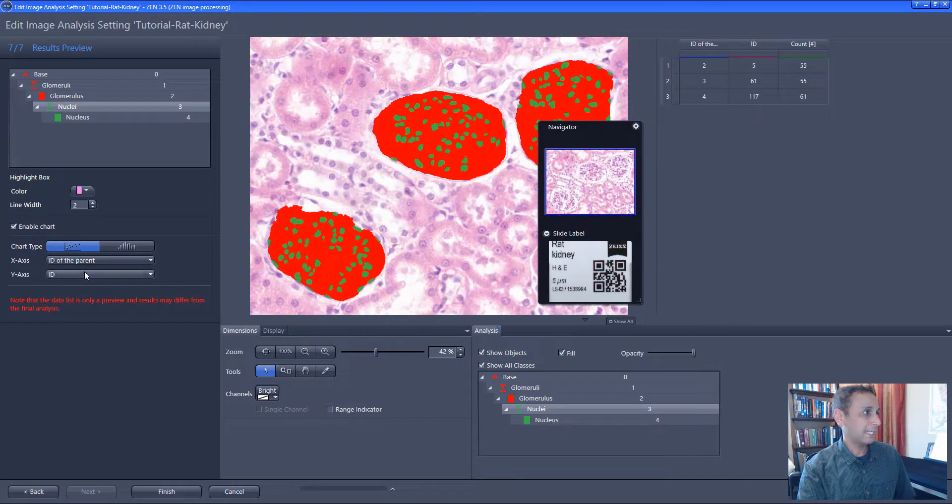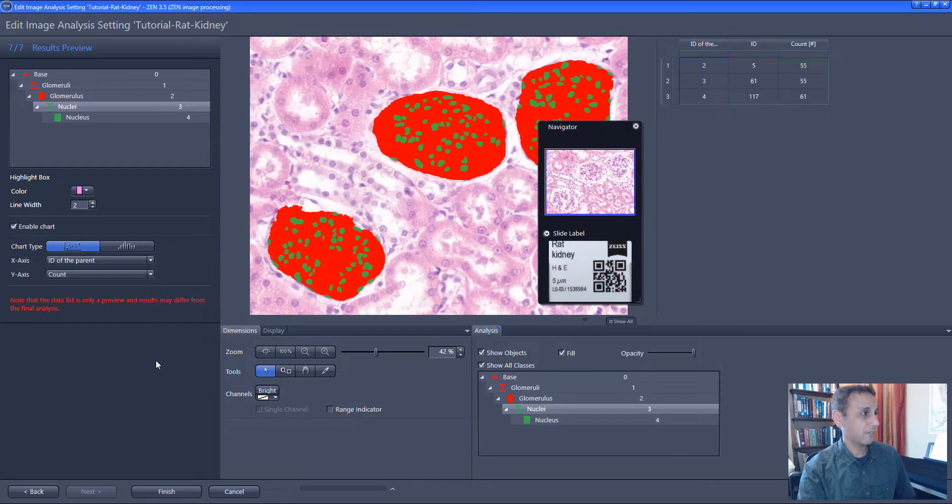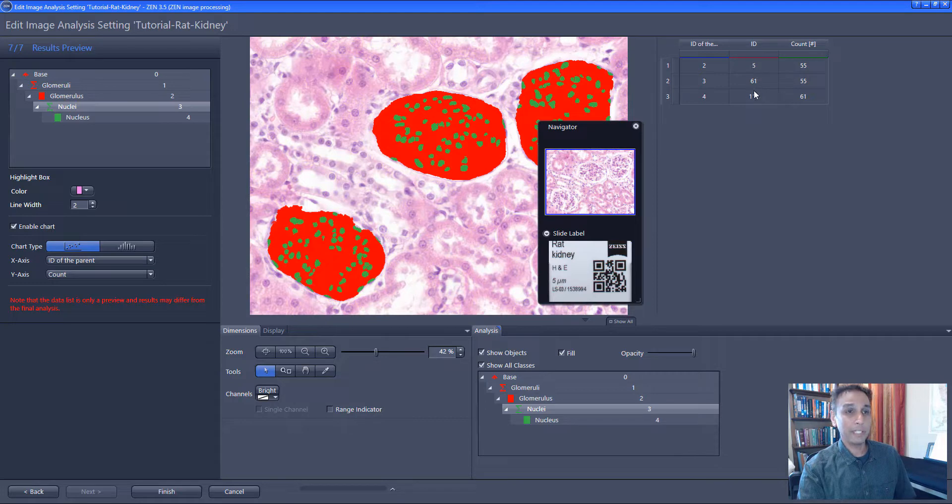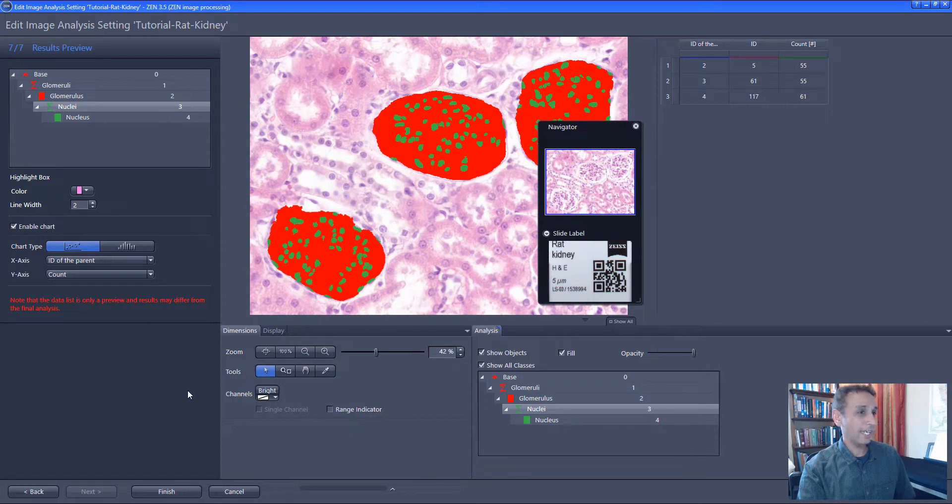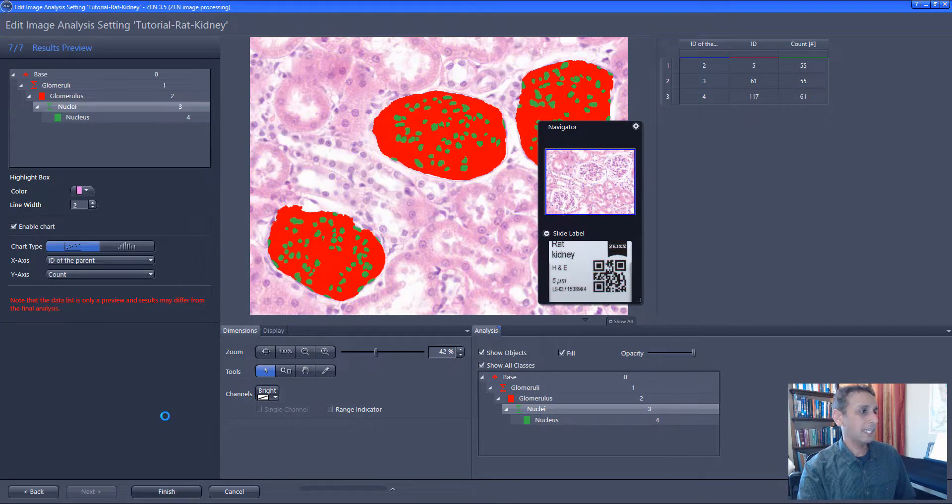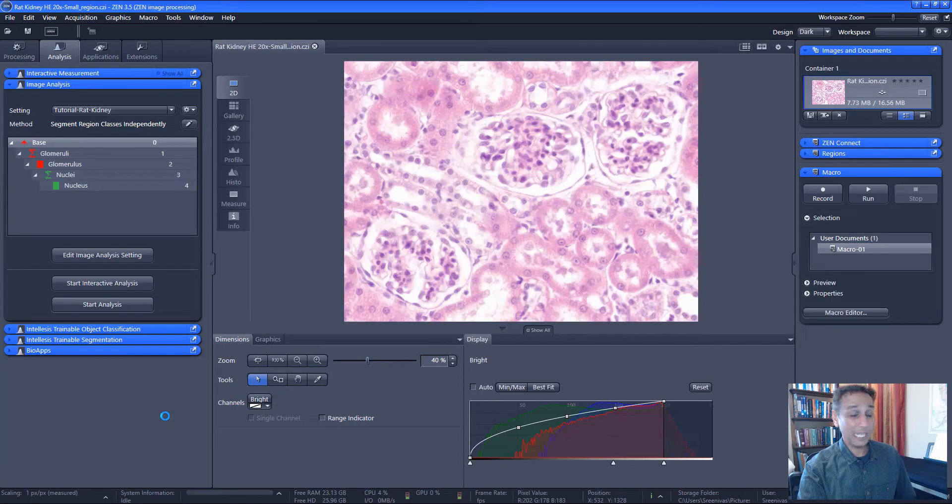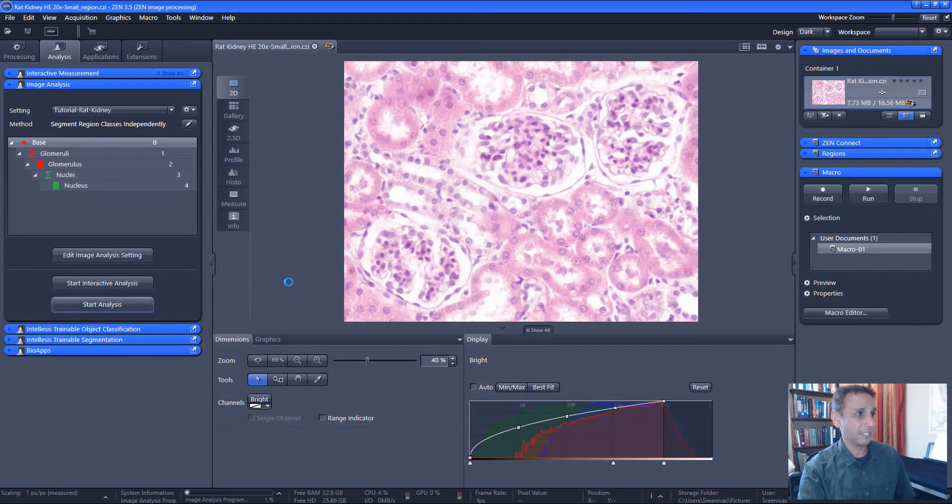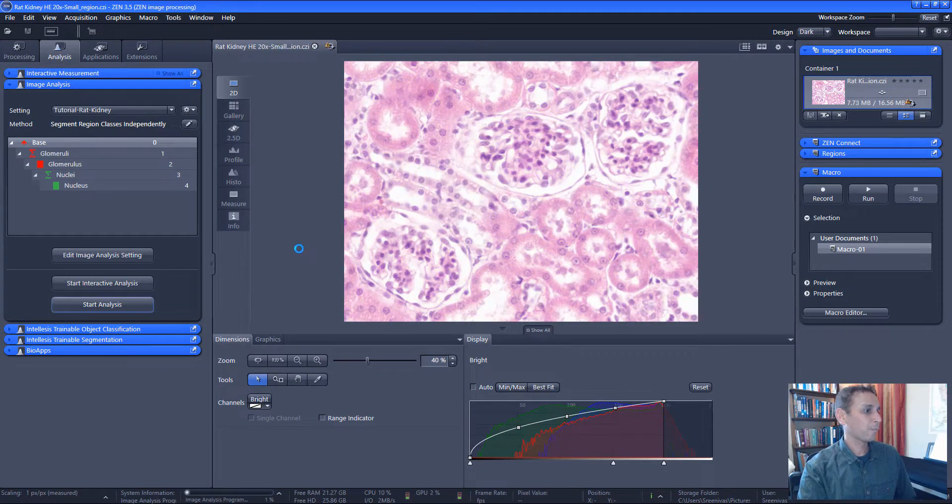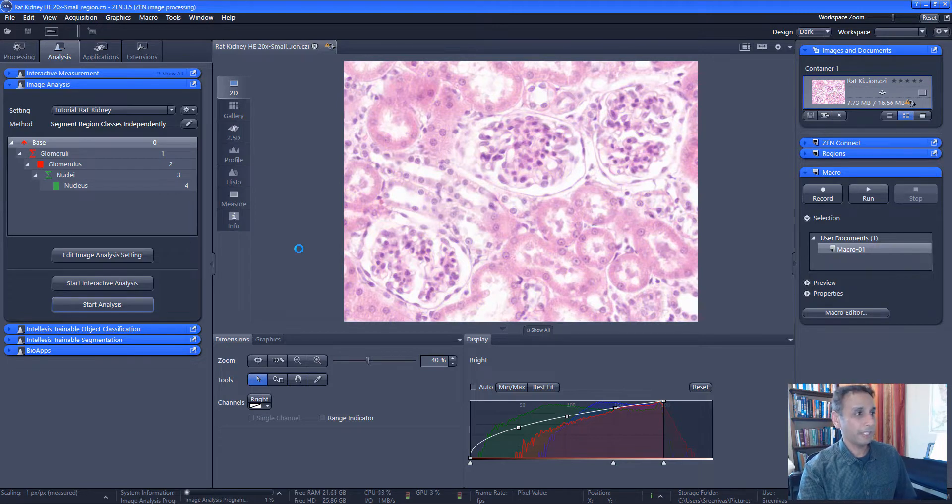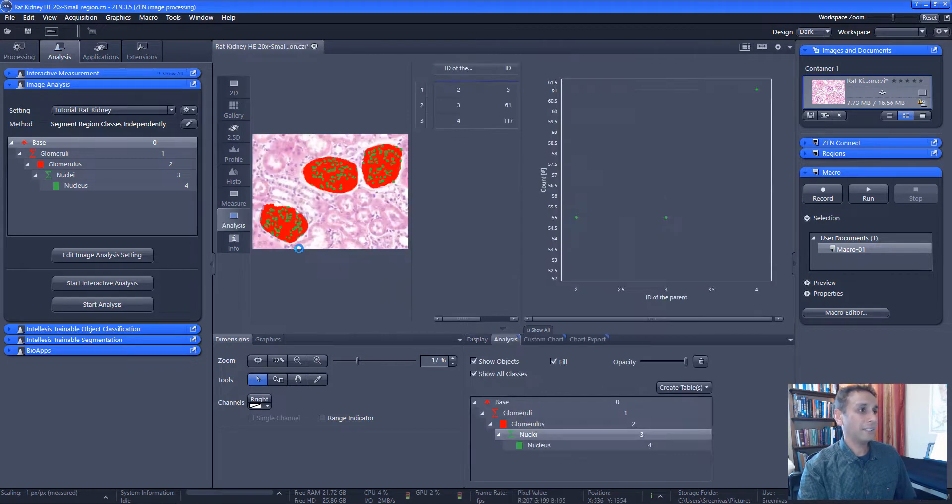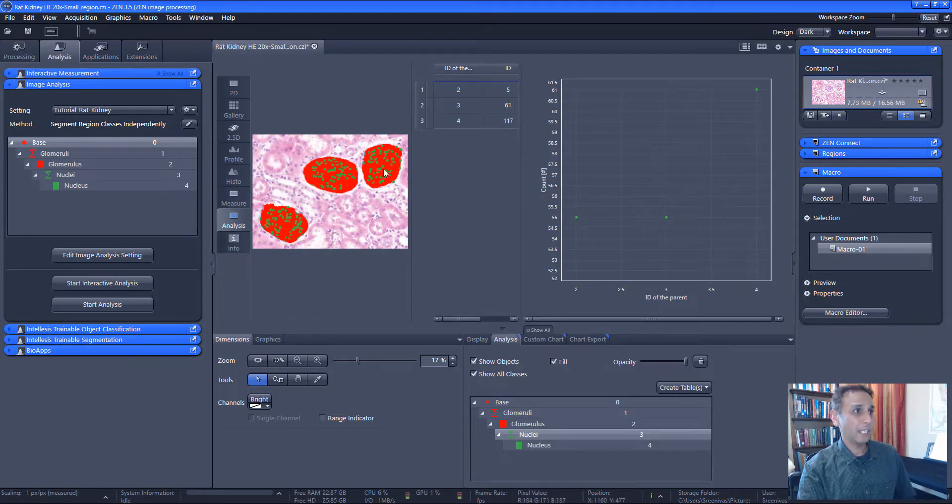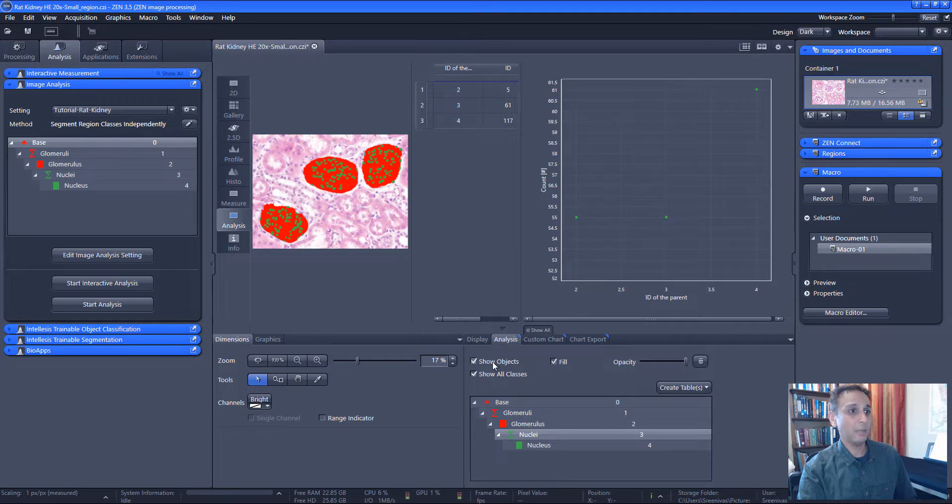We are done setting up image analysis. Again, we see the count over there. And now let's go ahead and finish this process. And the image analysis setting is saved now. Now it's ready to be used. Let's go ahead and start the analysis. It should take a few seconds. We are getting there. There you go. And all of these, they are analyzed right there. And for each glomerulus, you can see what the ID is and how many objects are there.